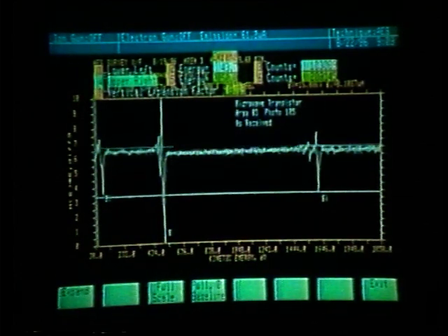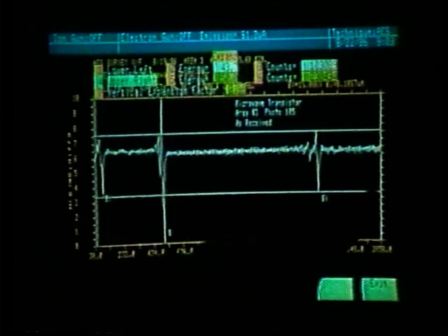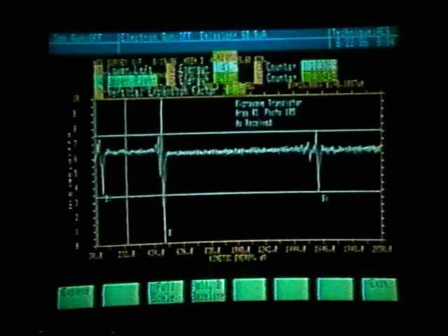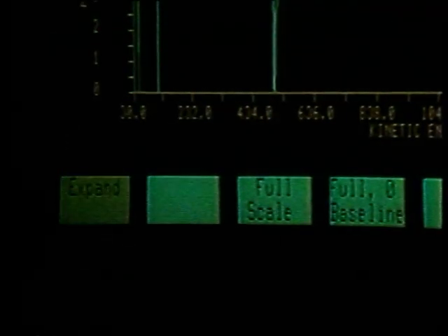Move the upper portion using the up arrow, and the right portion using the left-right arrows, to define a window about the energy that I wish to expand. We now have defined a window around the low energy silicon peak. To expand, we then press soft key number 1.